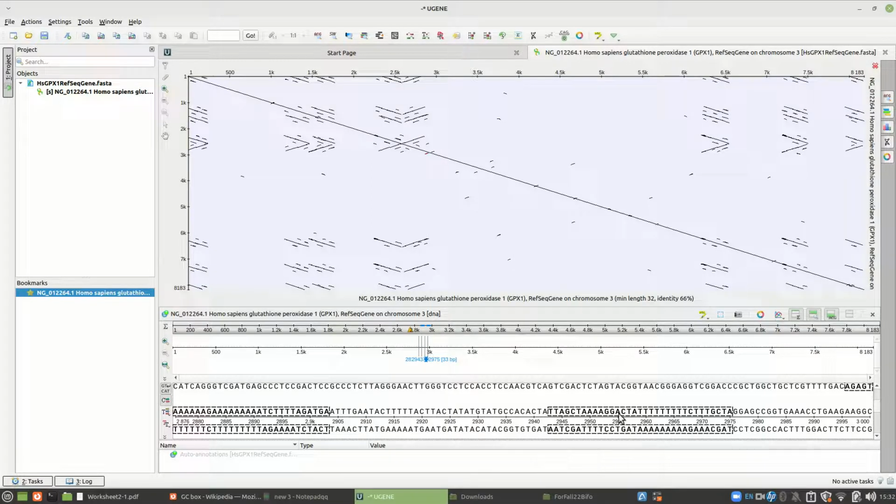Here's a fifth one with a couple of G's. So that's 4, 5. And you certainly do have 5 here in a row. The 2 G's, don't worry about. Do you see some T's with a CC in them, for instance? So a bunch of T's and a CC, since these are GG's. That would be one thing to look for. I don't see anything like that.